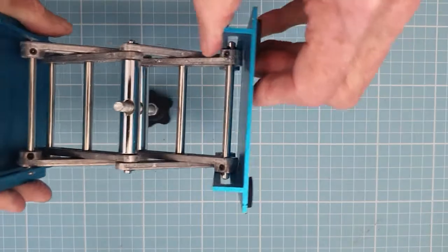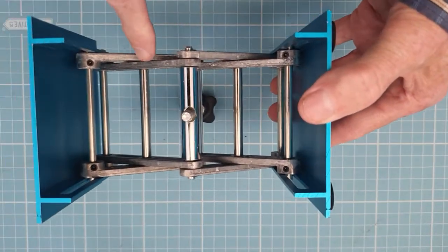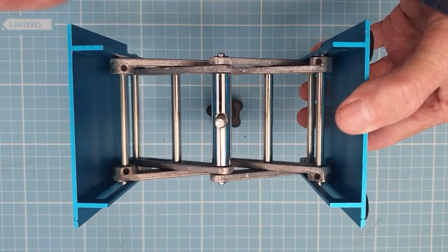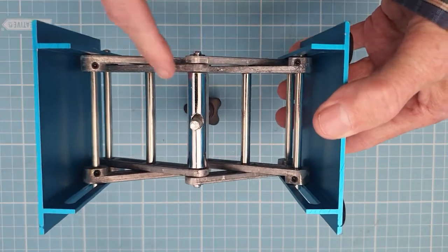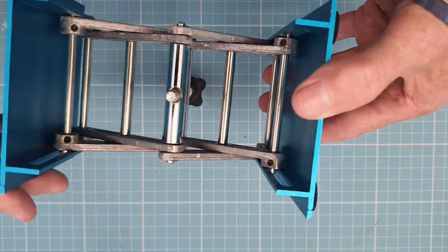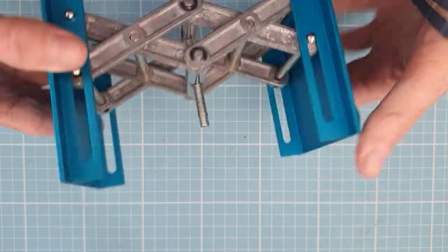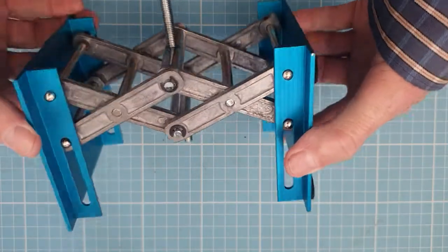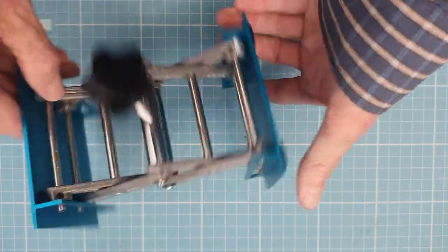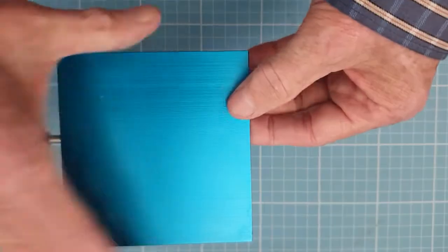It's got reasonably thick elements in the scissor structure. Others I've seen have just got sheet metal and are definitely more wobbly. The platforms are made out of extruded aluminum, so overall it's not a bad unit.